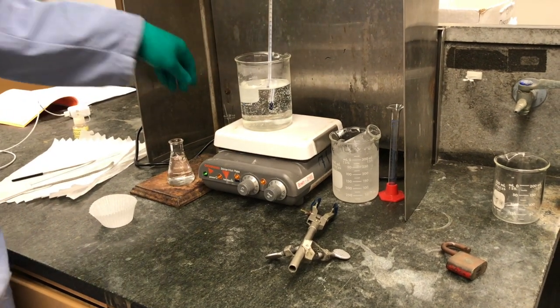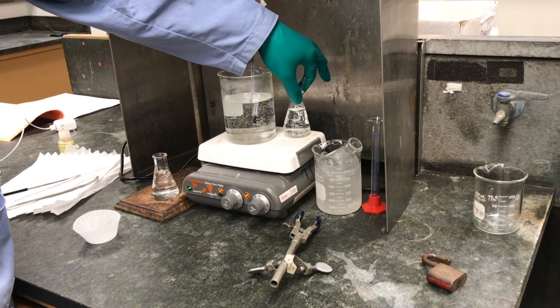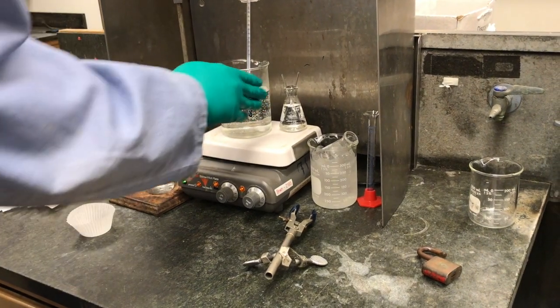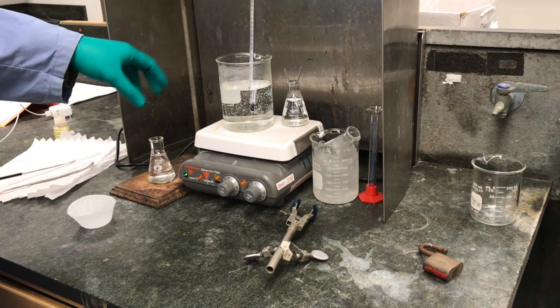While we're letting that cool and recrystallize, I'm going to start heating up some ethanol for the recrystallization to purify the crude product we'll get from this. So I'll start heating up some ethanol, and then once I add the water, I'll heat up some water as well.